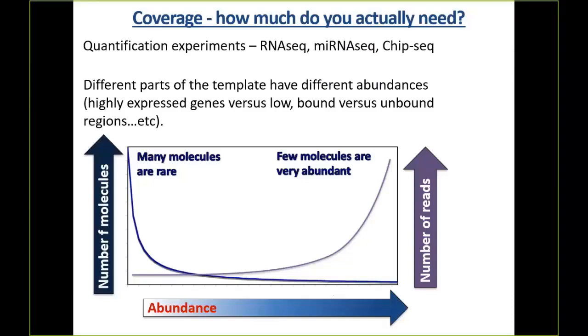If I have a read count in the cell of 1 million, okay, my odds are getting better. But really, if I'm looking for transcription factors in a cell, I'm going to have to do very high depth sequencing. I'm going to have to do a lot of reads in that cell just to get a decent number of read counts on my transcription factor. Does that kind of make sense to people?